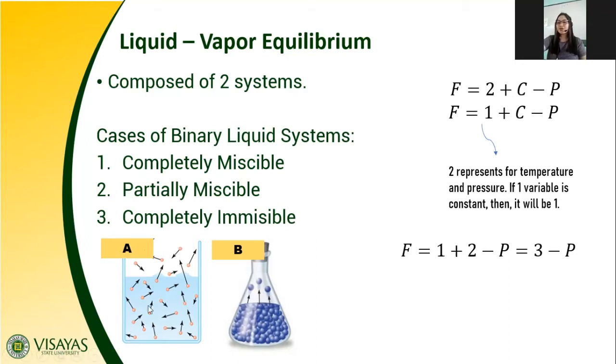From the liquid phase, some of the atoms or molecules need energy, and due to their volatility they convert into the gaseous phase, the vapor phase.